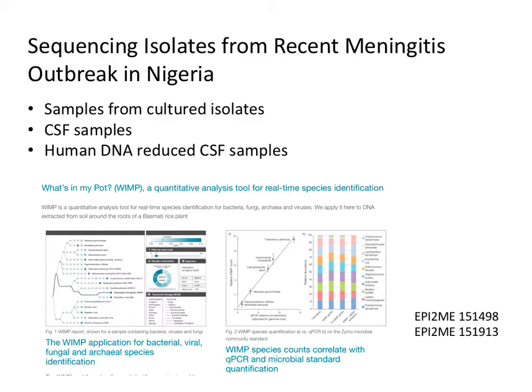So what you do is, it's actually also in Illumina. Then you think about what your input material is and what you sequence. This is quite a logical thing to think about. I would ask you for 200 nanograms to make a library, but I'm only going to load femtomoles on my machine. But I can't ask you for femtomoles, because I will not be able to make a library from such a small sample. So I'm asking you for a lot of sample for what I actually need to load on the machine.